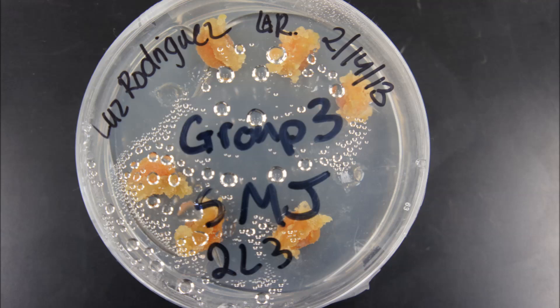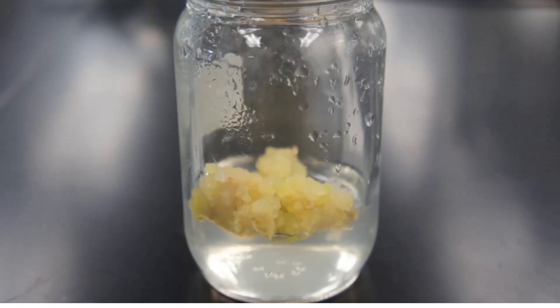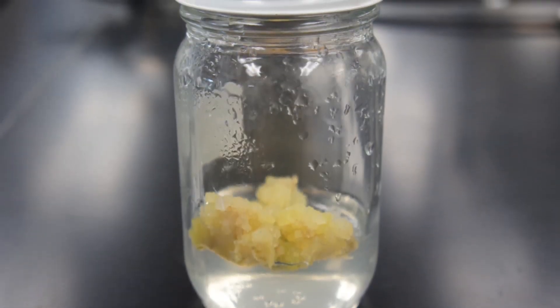In one to two weeks, callus will begin to form on the explants. In four to six weeks, it will be one centimeter in diameter.